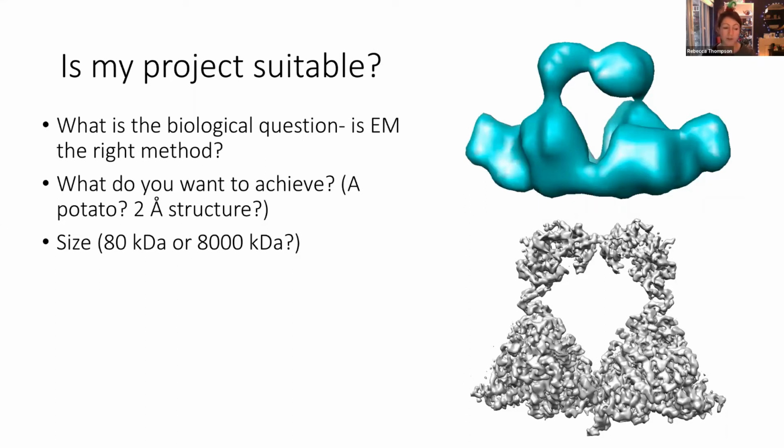The second one is how big is your macromolecular complex? So routinely, electron microscopy or cryo-electron microscopy, single particle approaches have been traditionally applied to proteins with a macromolecular complex size of ordered density. Because remember, if your density is not ordered, then you won't be able to average that between individual particles, and therefore it doesn't count towards what we talk about as that ordered mass. Typically, we're working with protein complexes 150 kilodaltons, 200 kilodaltons or larger.